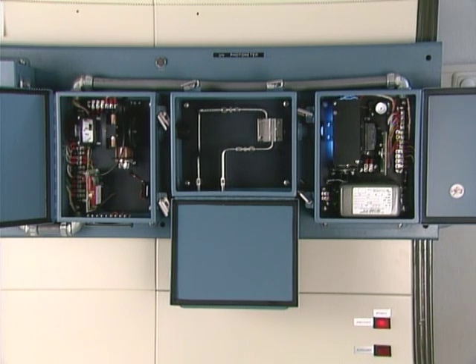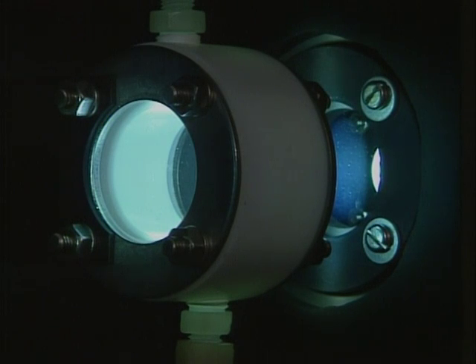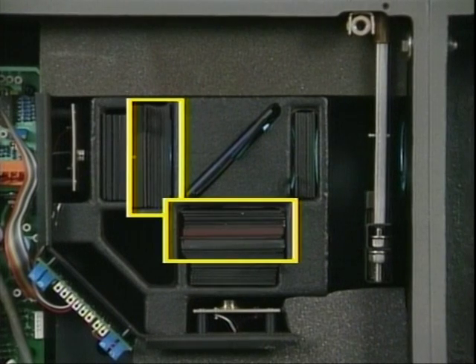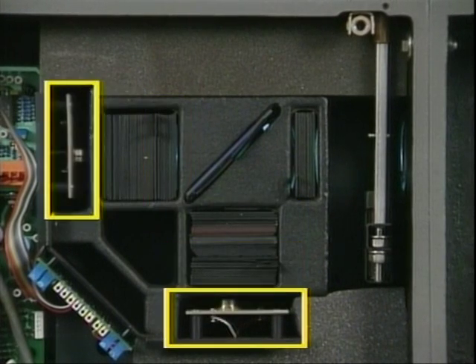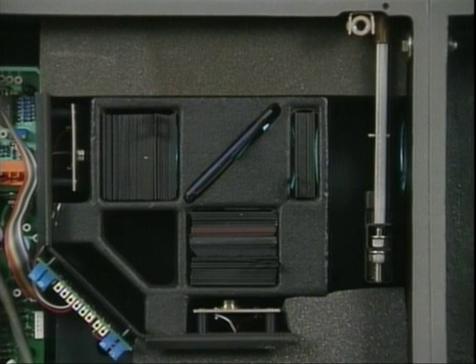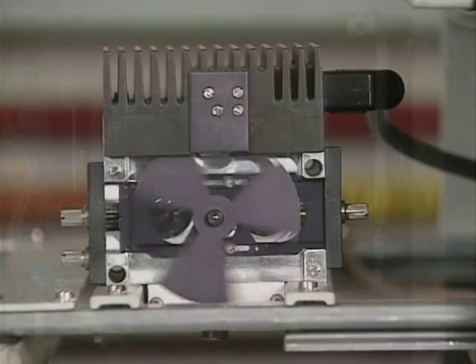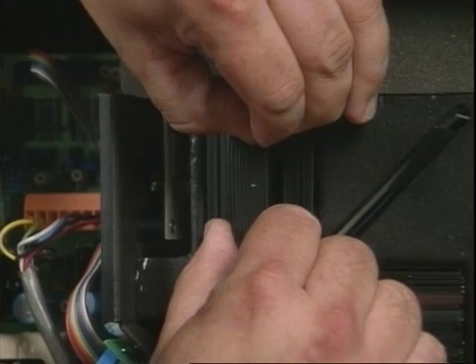A spectroscopic analyzer optical path usually contains the following devices: a sample cell, the type and style depending on the analyzer light source and the process analyte, measurement and reference filters, lenses, and detector. Some spectroscopic analyzers might also contain beam splitters and mirrors, or a chopper wheel and motor.